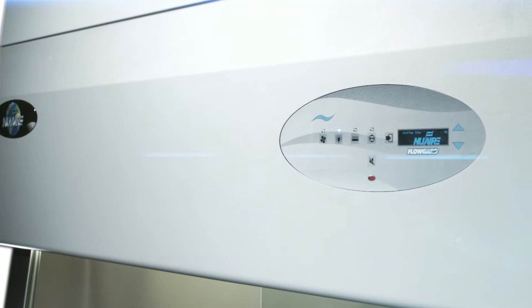No two cabinets are built alike. NuAire is demonstrating their commitment to offering the highest build quality available for your safety.